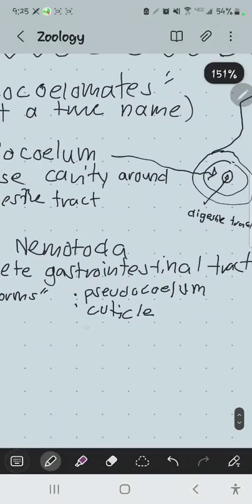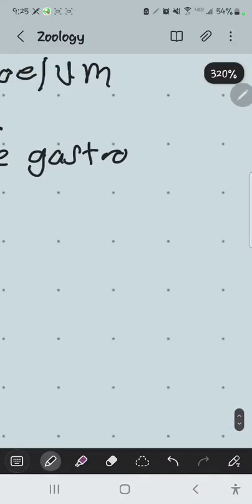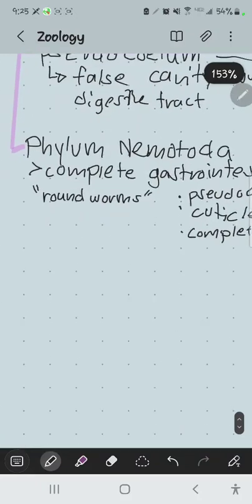Okay, so what I'm going to do here is list some specimens out that you potentially could see. But the main question for classification is these are all nematodes. But for each one of these nematodes, I probably will ask you, if it's a parasite, where does it live and how do you get it? Right? It's kind of the main thing. And so Ascaris, which is the main intestinal parasite that occurs in mammals, and also occurs in reptiles and other organisms as well. But Ascaris is a real common one. And in fact, it's common in humans as well.